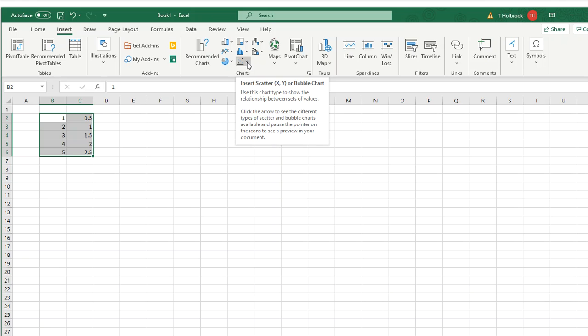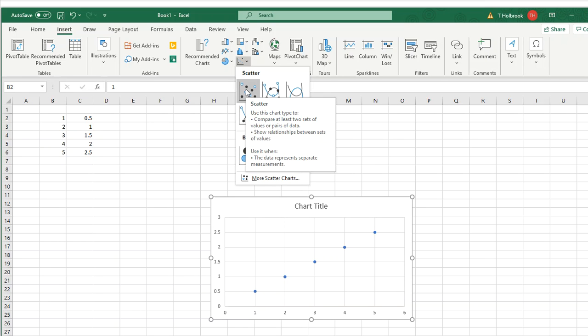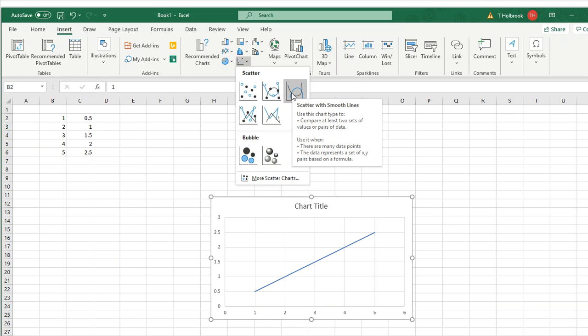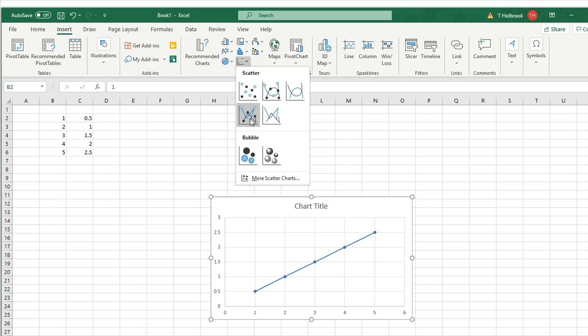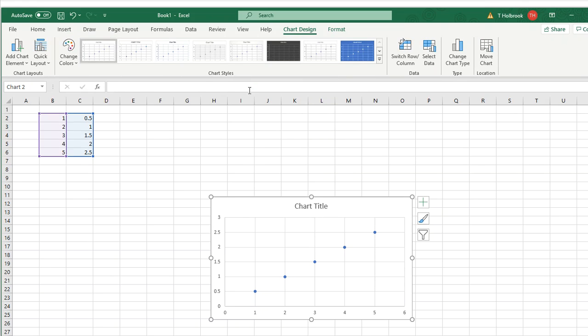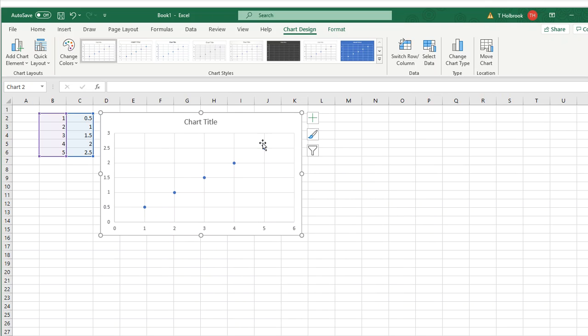So I'm going to click that particular type of chart. And there's a couple of options. If you click this arrow that's right beside of it, do you want dots? Do you want dots with a line that goes through everything? Do you just want the line that goes through everything? Do you want a non-smooth line that goes through everything with the dots? Or do you want a non-smooth line without the dots? Folks, we just want dots here. We want to keep it simple. So I'm only going to plot the dots and that's it. And that's what we call a scatter plot. So I click it and my graph comes into the picture. And there is my graph.